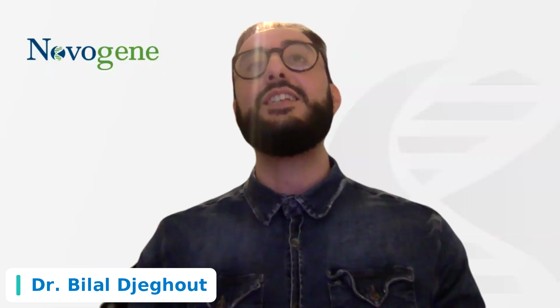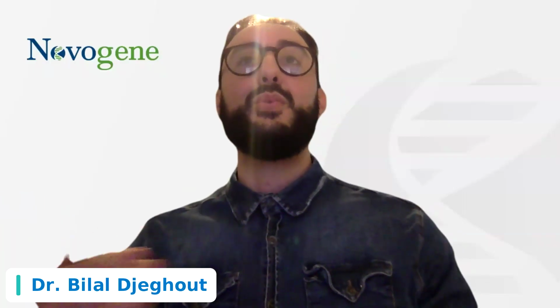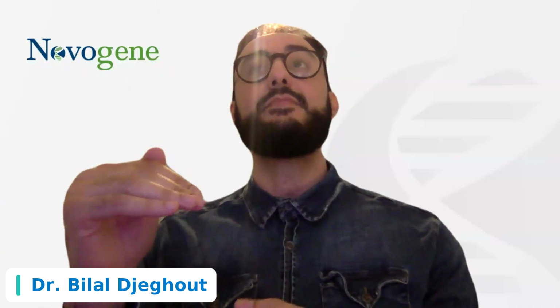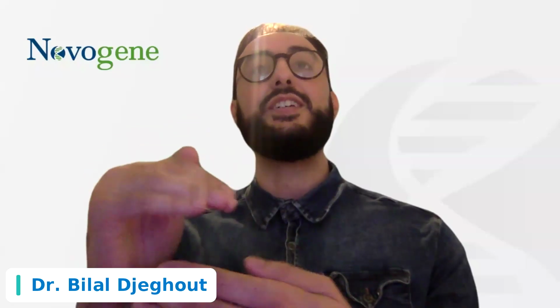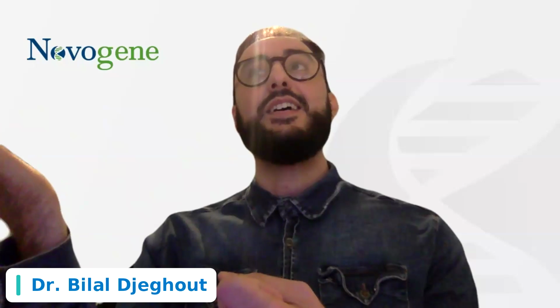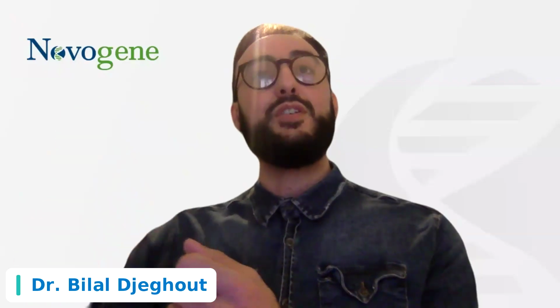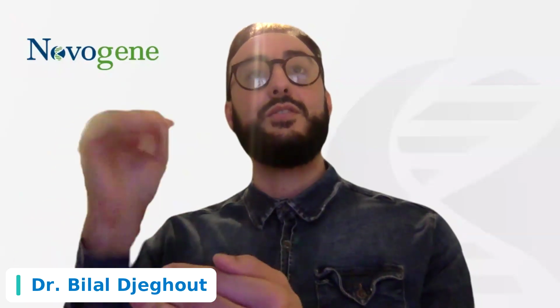Just to clarify what adaptive sequencing is: with Nanopore sequencing, you have the chance to tell the machine, while you are in the process of sequencing, to enrich for Campylobacter. You upload Campylobacter genomes to the system.